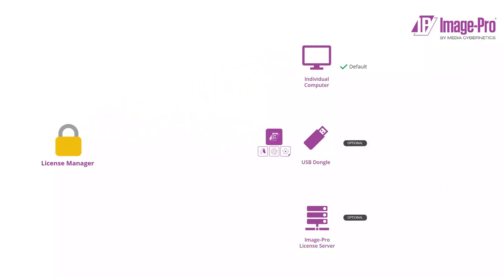When a bundle is linked to a dongle, any user of any computer to which the dongle is connected is licensed to use ImagePro.